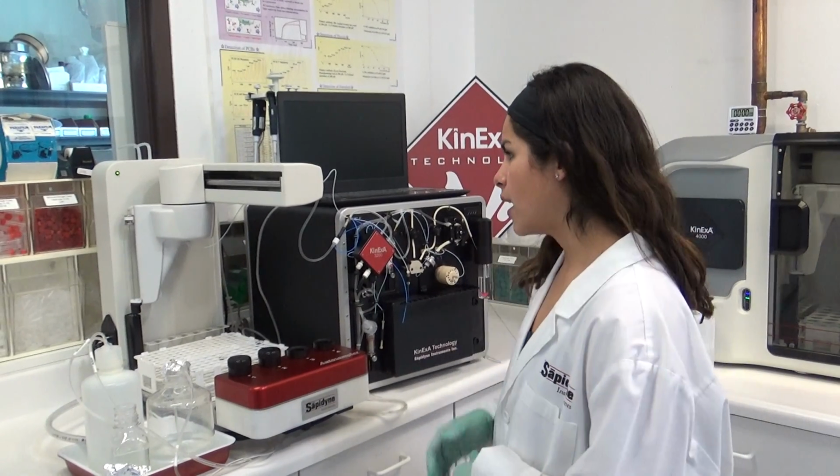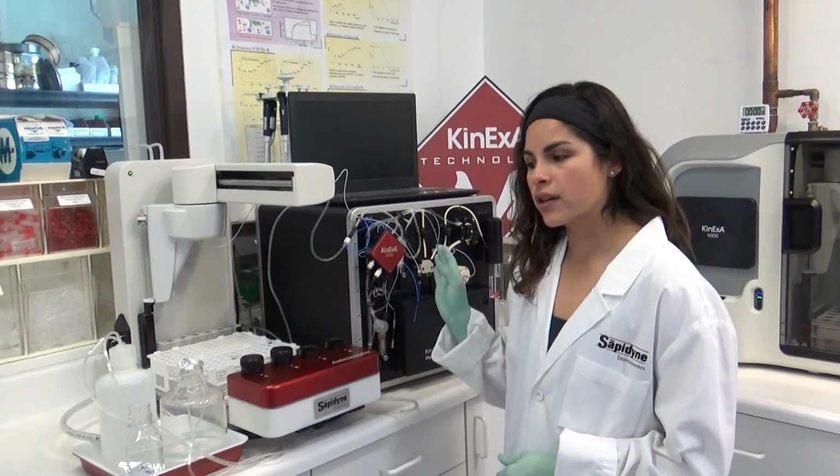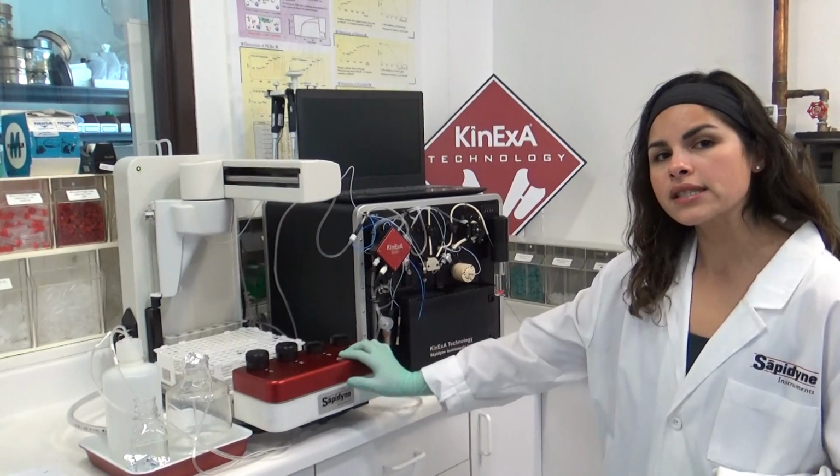For this video, I'll be covering how-to guide 203, that's the flow cell replacement and alignment. To start, I'm going to be using the 3200 and the auto sampler. You'll need some materials for this.